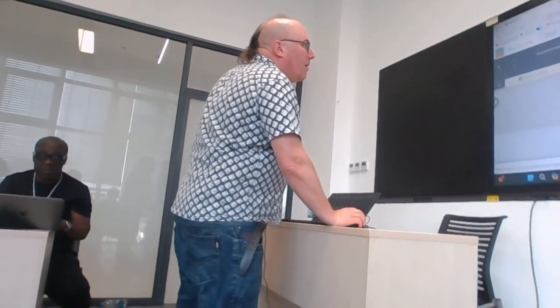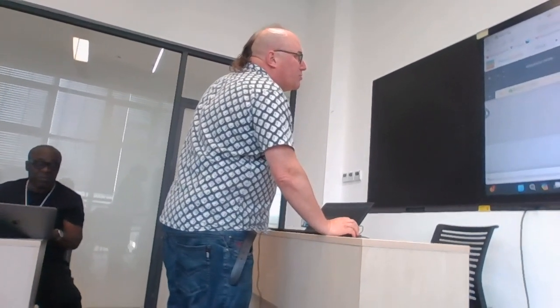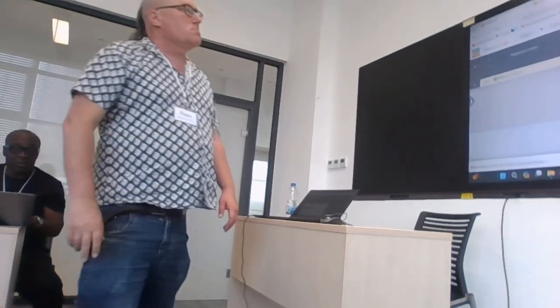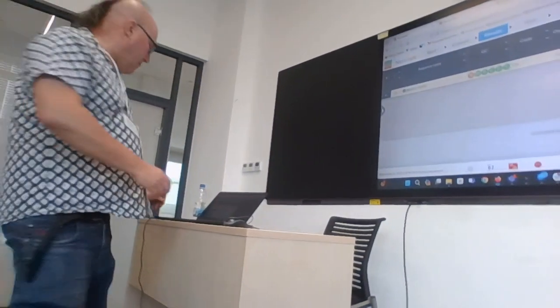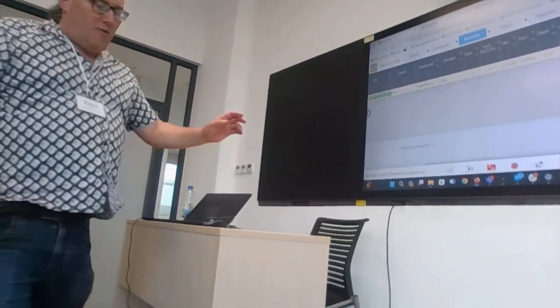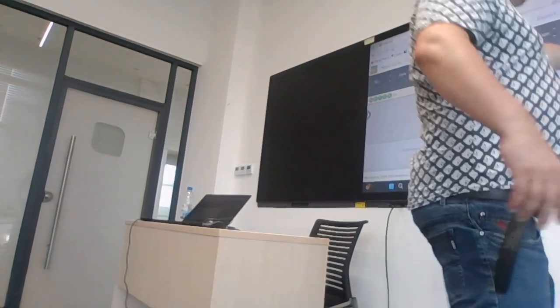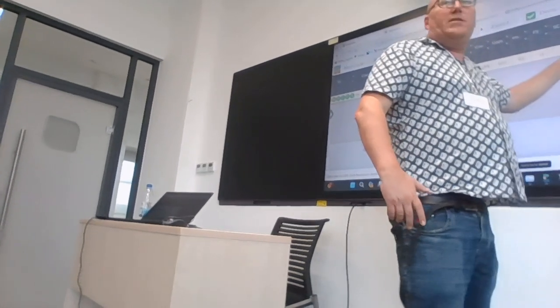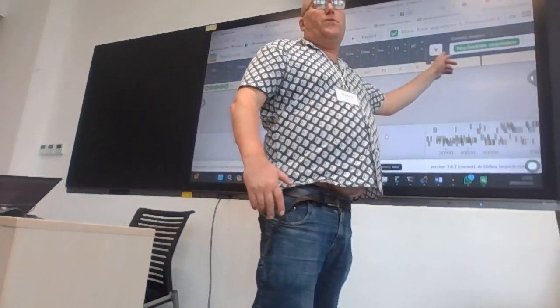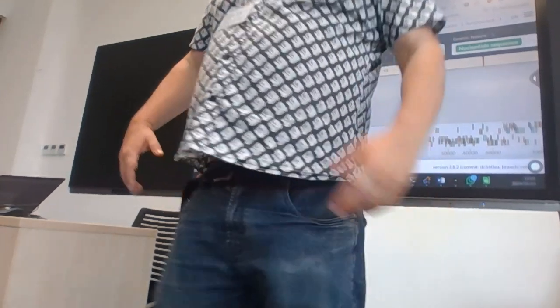And this, compared to this reference, which is a 2022 reference, just to illustrate, scrolling a bit, this picture shows in gray where we are missing data. We're missing data at the start of the genome.